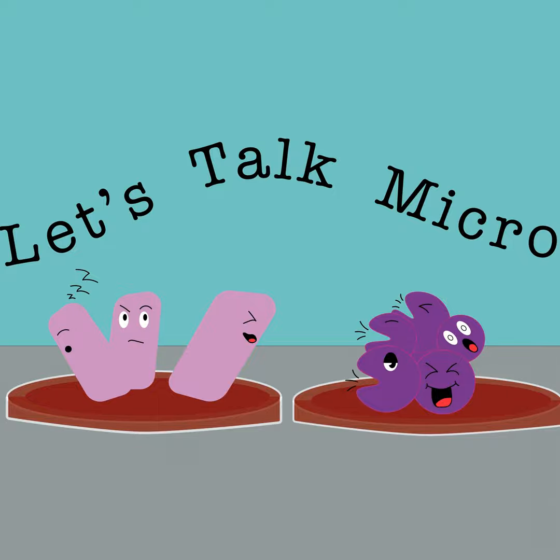Although through Zoom, I was surprised at how much I could help them. They'd take a picture and it might be fuzzy and I'd be able to tell them, well, look over here or do this or do that. So that was helpful. I even had a student assistant, and my student assistant had a microscope at home, so she could Zoom with them and help them figure something out. One day, one of the girls didn't realize that she hadn't put the ocular lenses in correctly, and the student assistant helped her figure that out. So we could solve some of the problems via Zoom.